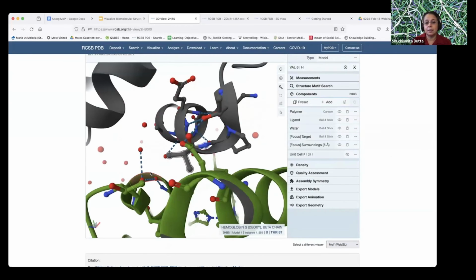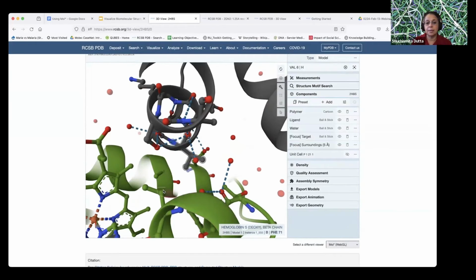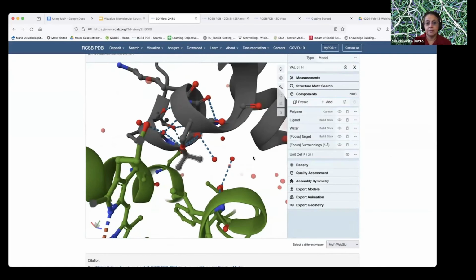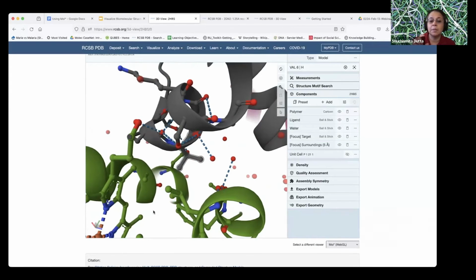And if I click on it, this is sitting in this hydrophobic patch of this alanine, this phenylalanine, and this leucine. So a hydrophobic side chain finds a home in this hydrophobic patch. And this is really the primary interaction that begins the polymerization, which will lead to the sickling and all these complications. So understanding this was very critical.